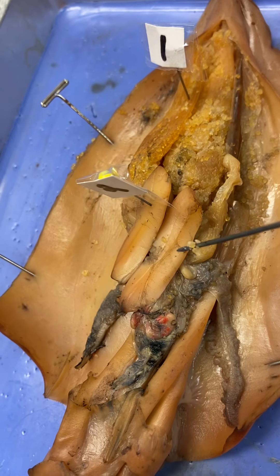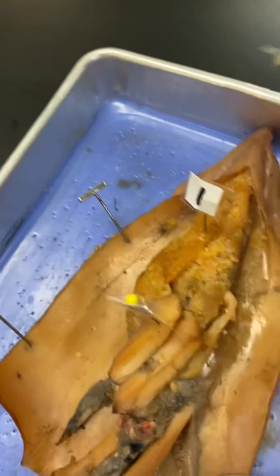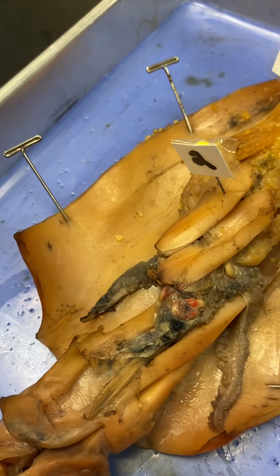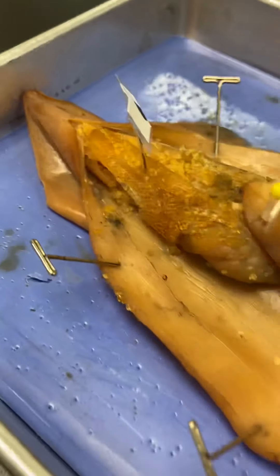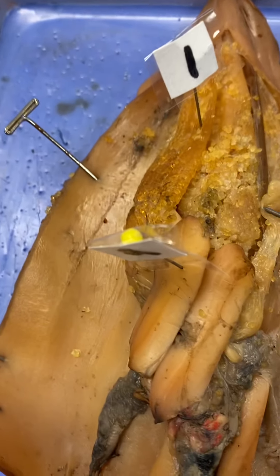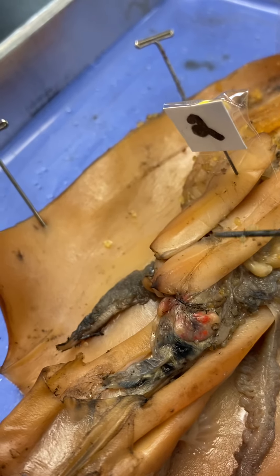You can see more structures in the male because in the female they cover all the structures. Here is the female — the things that can be seen on both I don't have labeled again. What I have labeled on the female is the ovary — you can see all the eggs, so it should be easy to tell. Then you have the nidamental glands, which create the egg mass covering that turns all the eggs into an egg mass.